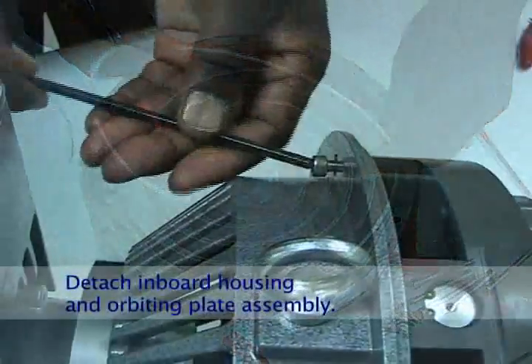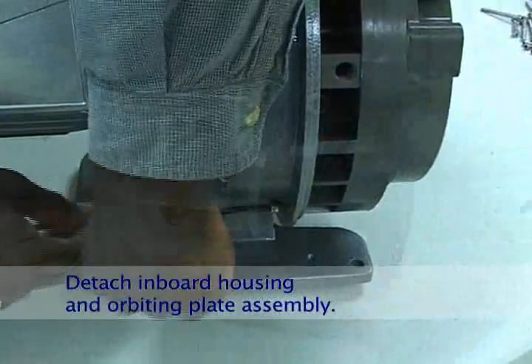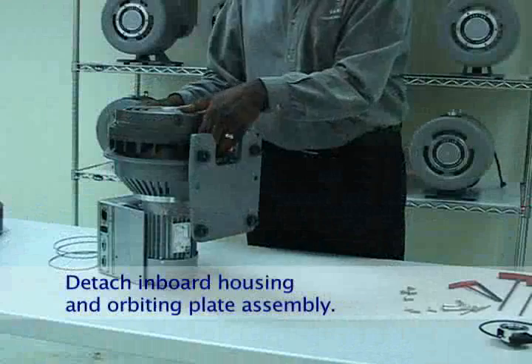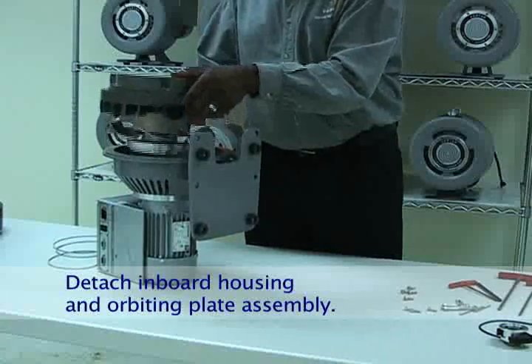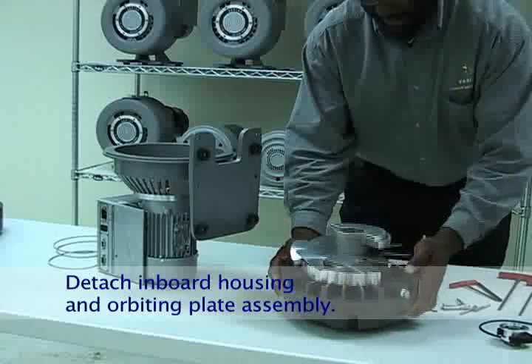Detach the inboard housing from the frame by removing the four M6 screws. Set the pump up on end and carefully lift off the inboard housing. Set the housing down, fan side up.